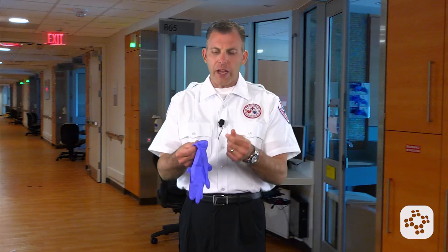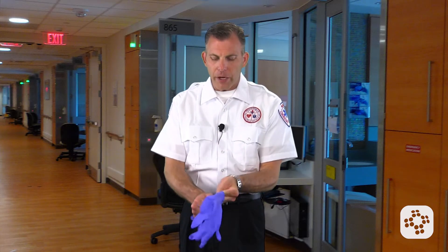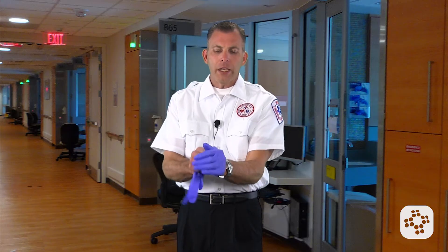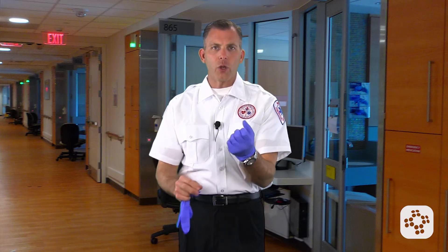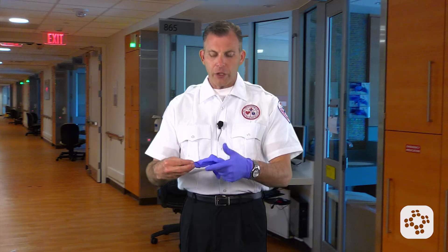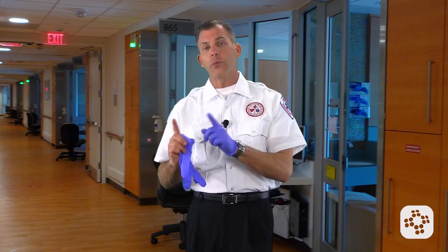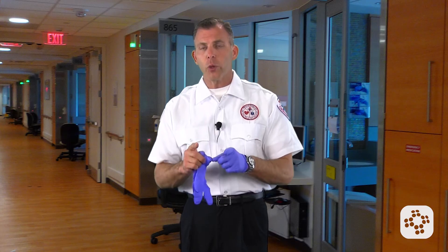Now they're kind of powdered, or they have some kind of coating on them, and they're a lot better for getting on. If your hands are really wet or sweaty, dry them off appropriately and the gloves will go on a lot better. You can also make sure that you've got the appropriate size. For employers, it's important to get the appropriate size for your employees.